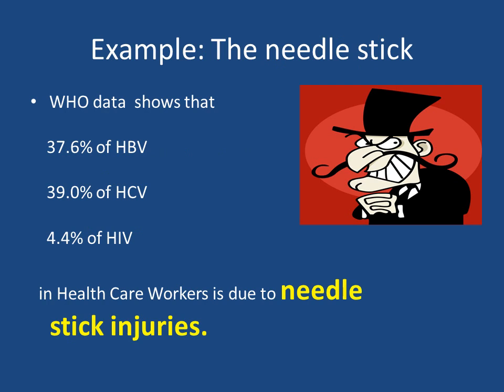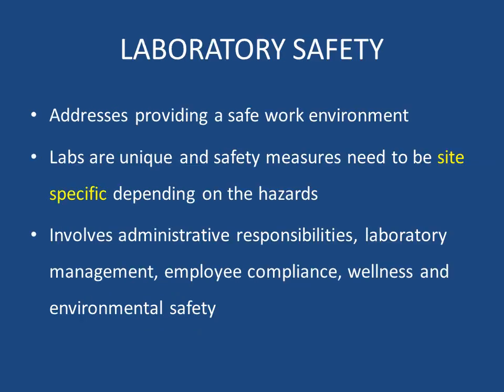The needle stick injury is the villain of laboratory safety. WHO data shows that 37.6% of hepatitis B virus, 39% of HCV, and 4.4% of HIV in healthcare workers is due to needle stick injuries.